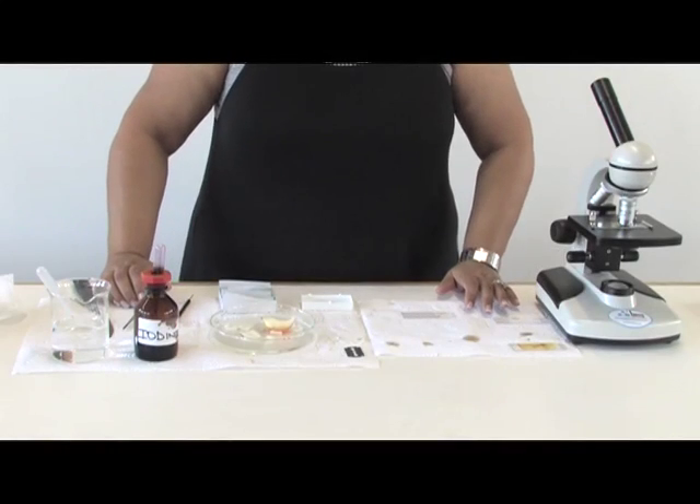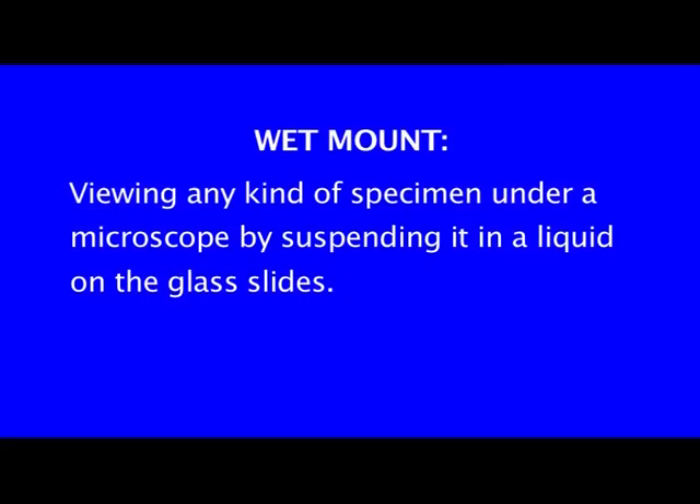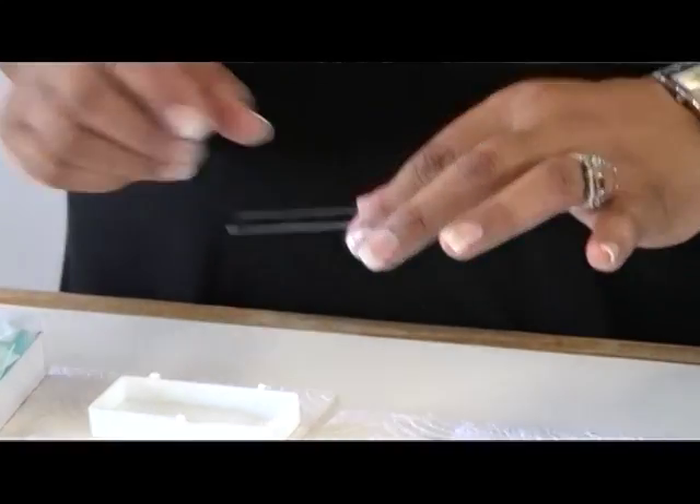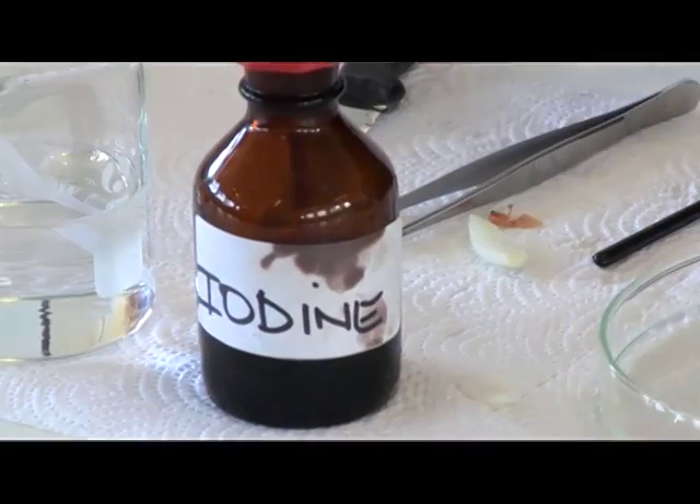In this demonstration, we will concentrate on the making of a wet mount and we will use onion epidermal cells. First of all, what is meant by a wet mount? A wet mount is when you want to view a specimen under a microscope and place it in a drop of liquid. It can either be water, and in this instance I will use a colouring agent like iodine solution.